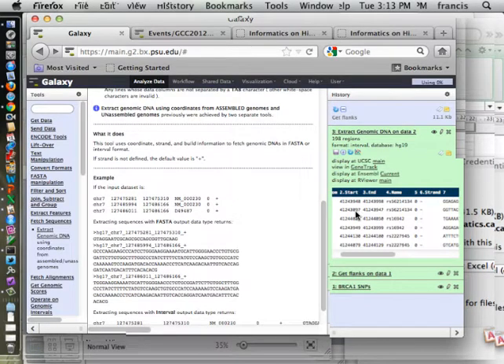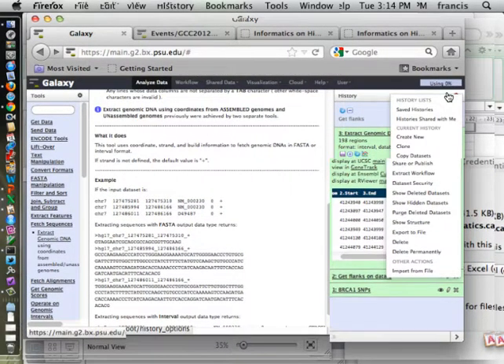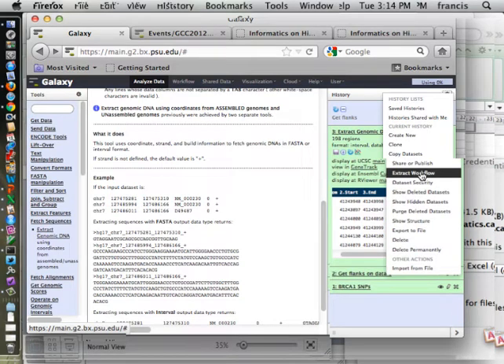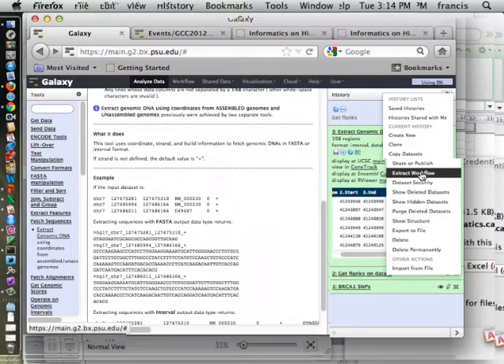And then the latest data set, extract DNA sequence. That's page 3, turn to page 4. And now we're going to actually repeat what we just did. First we're going to make sure that in step 3, all the checkboxes are checked. Options, history column, click extract workflow. So you click on the top dial here on the right, the gear thing, and extract workflow. You select that one. Everybody? Okay, so we're all going to do that now.